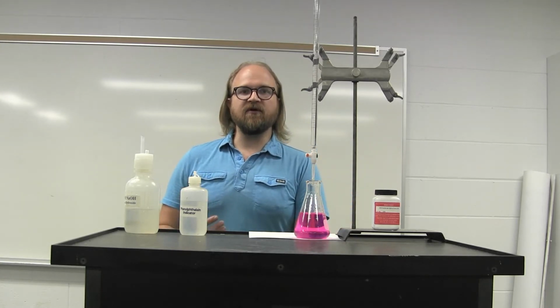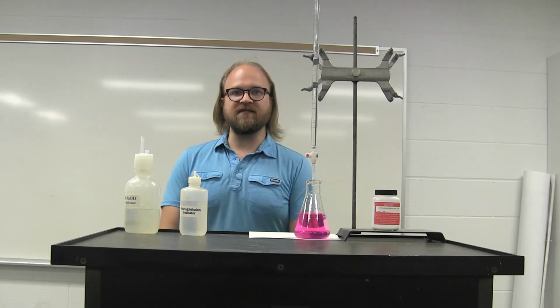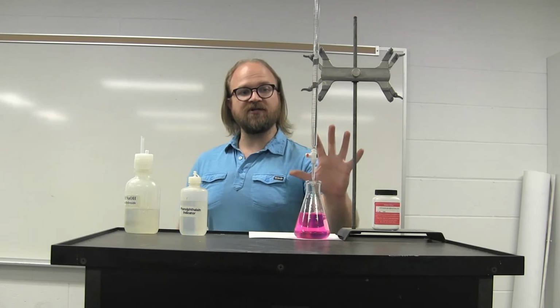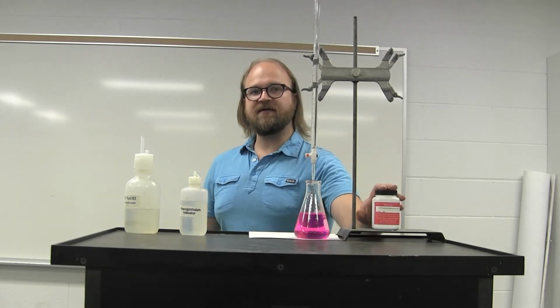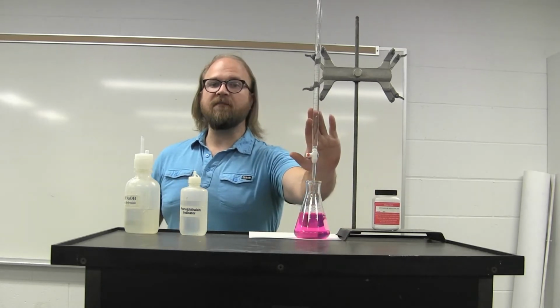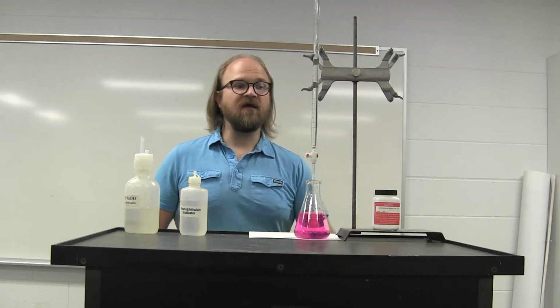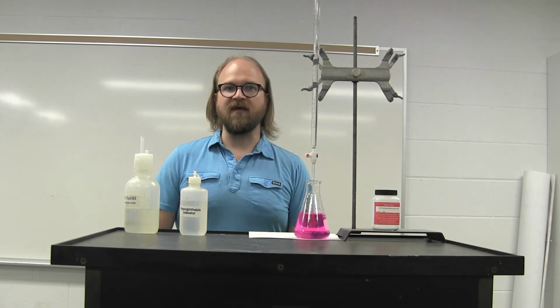In this experiment, you're going to be looking at a few of these different titrations. You're going to be looking at the titration of a weak acid and a strong base, sodium hydroxide, in order to determine the concentration of that weak acid.